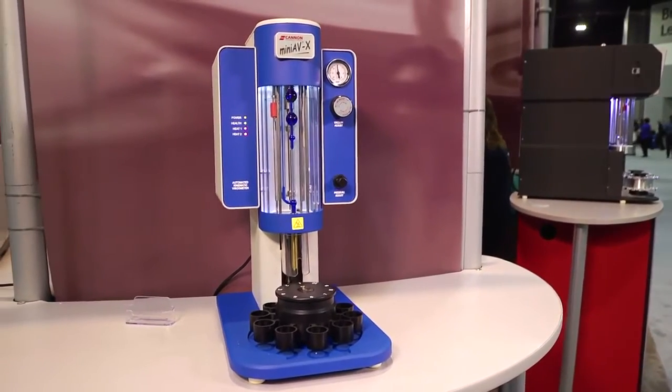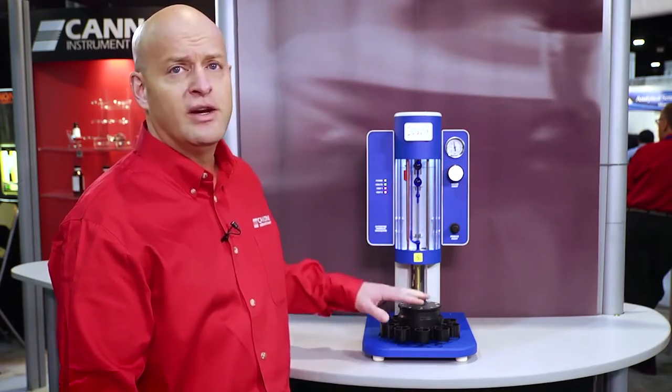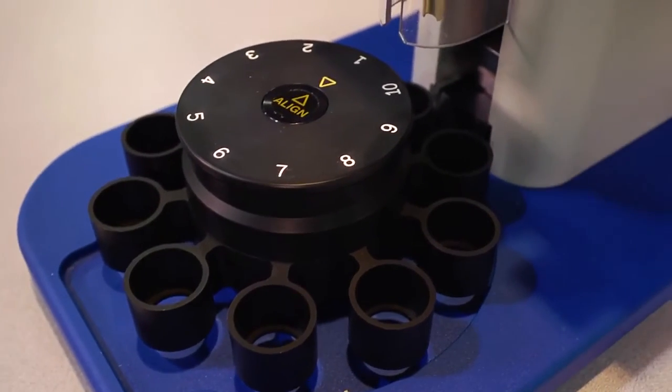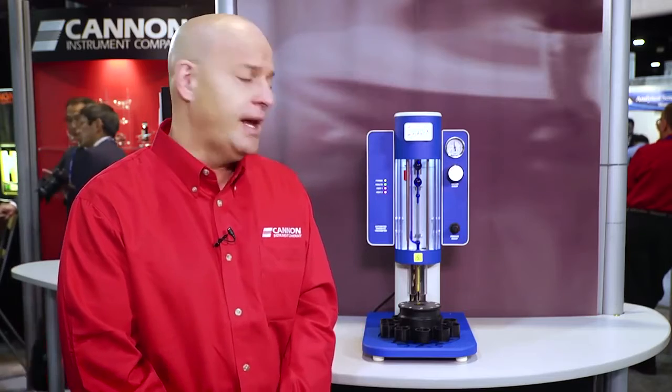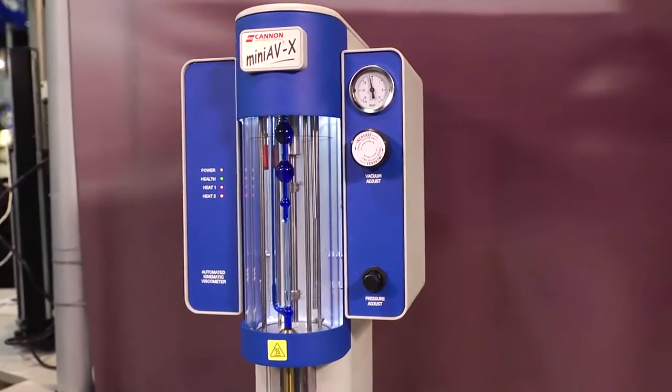This system is fully ASTM D445 compliant and comes with a 100-fold viscosity range tube and an integrated 10-position auto sampler. The system provides up to two cleaning solvents and will fully automate the measurement, the washing, and the drying of each sample in the carousel in sequence.